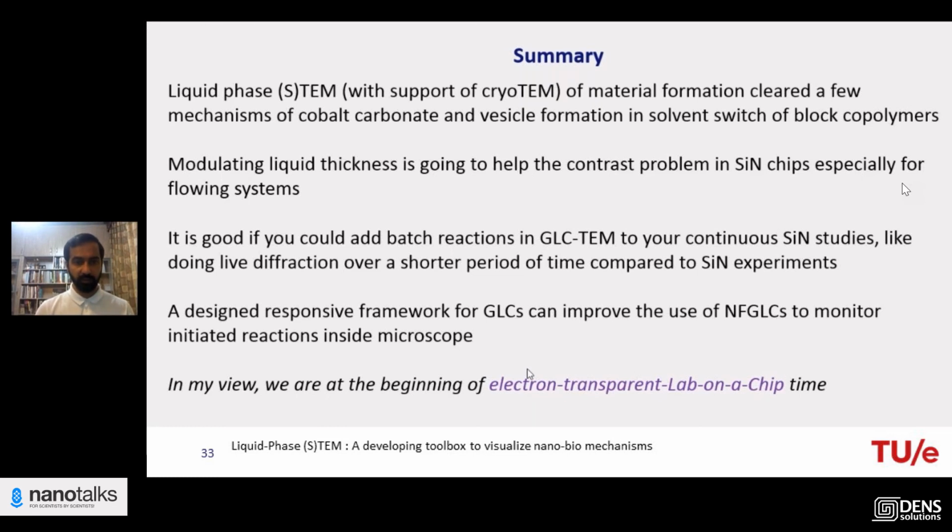I have shown that you can use GLC-TEM for batch reactions, and I have mentioned, this is very important, a graphene liquid cell is not just 2 layers of graphene. Depending on the resolution and the amount of sample you want to have, you can replace either of the 2 graphene layers with a thicker carbon shell.